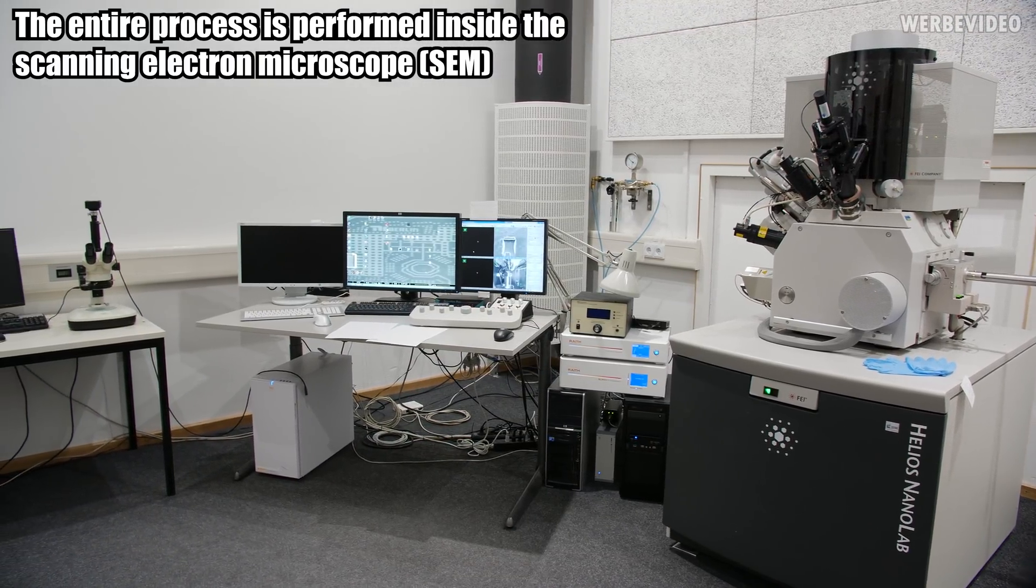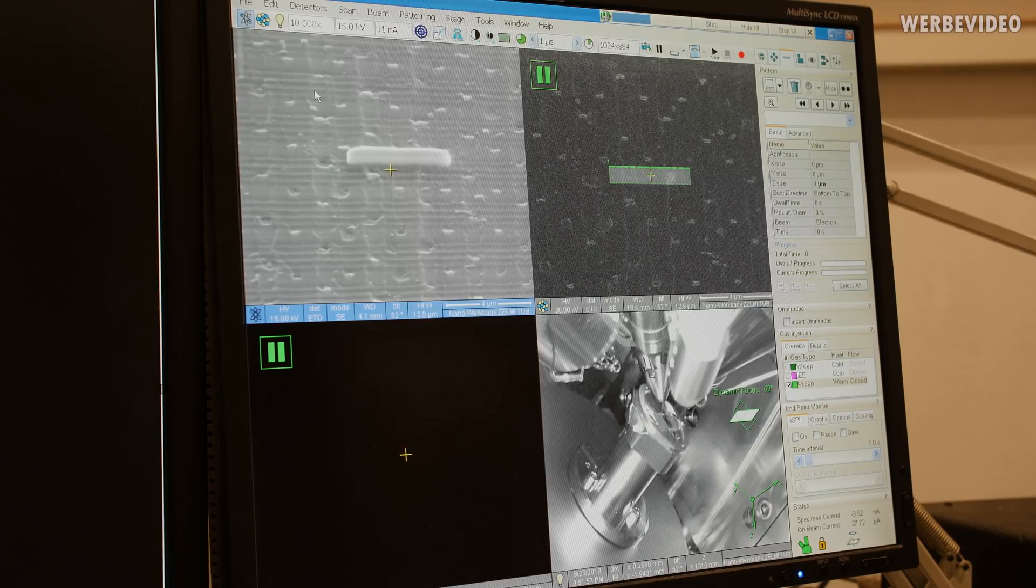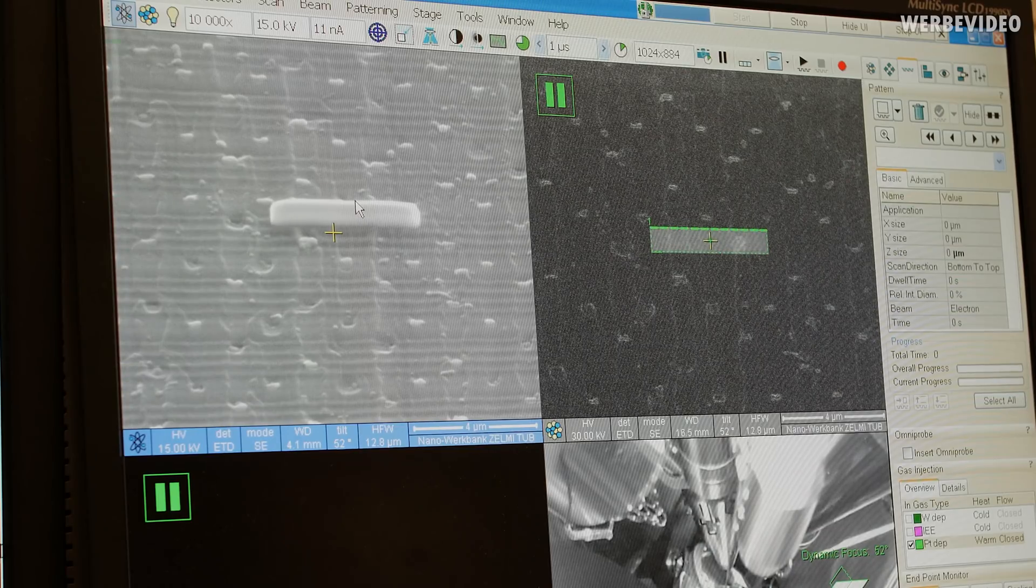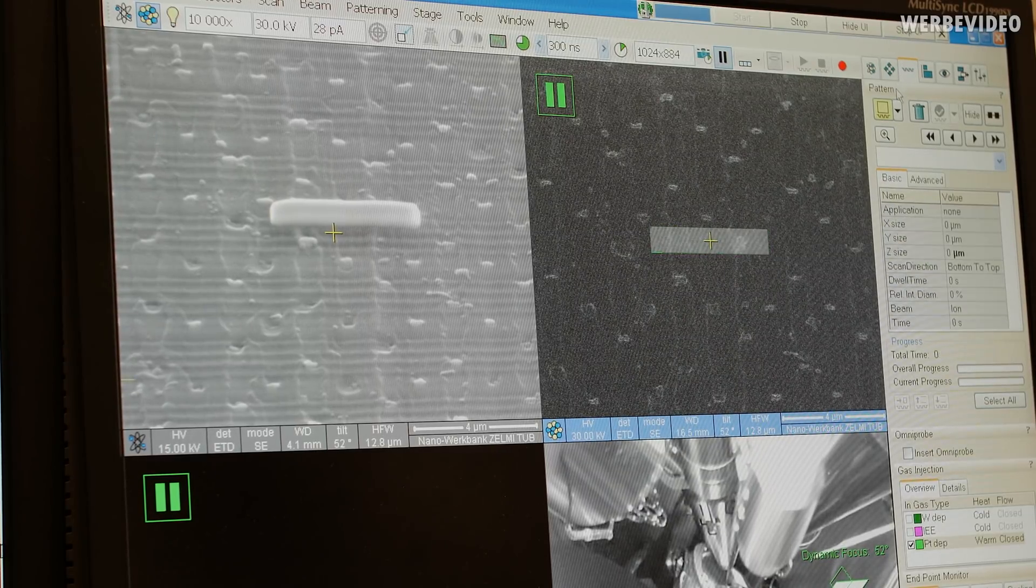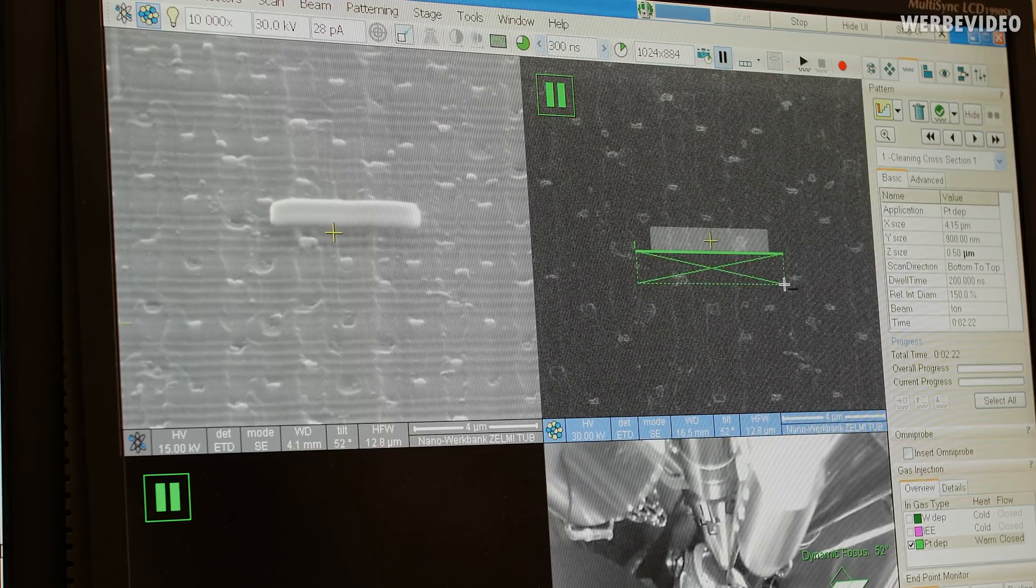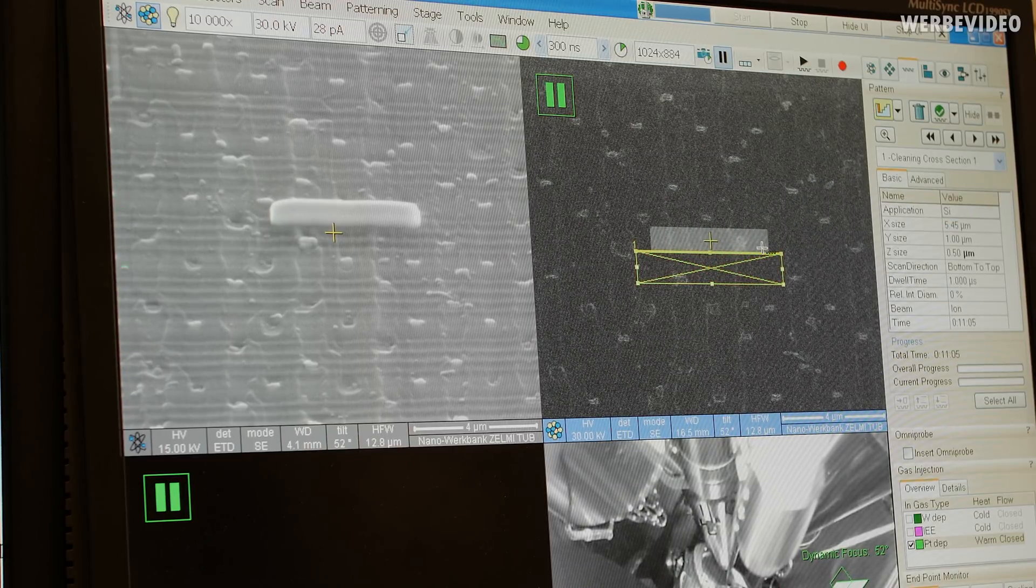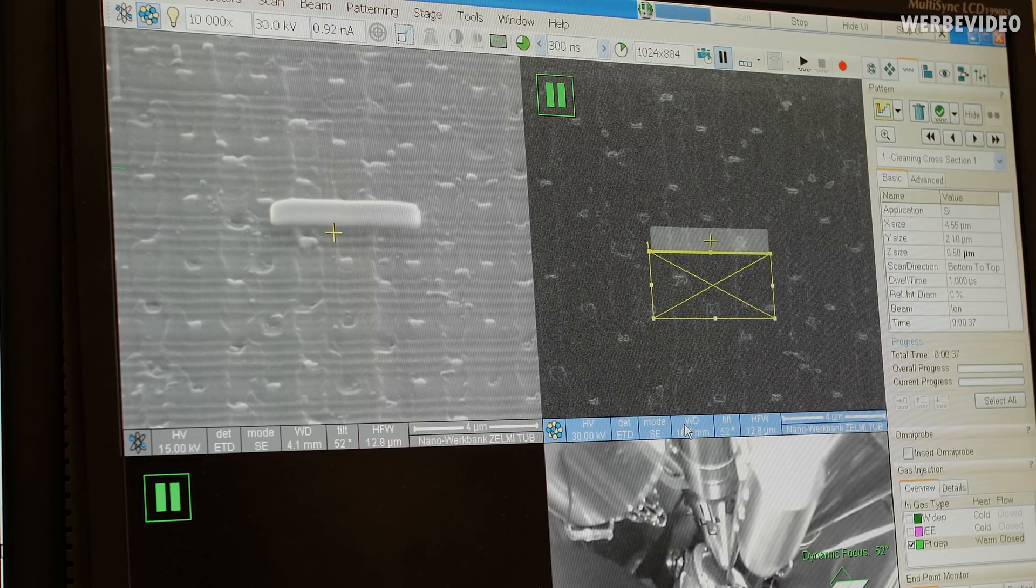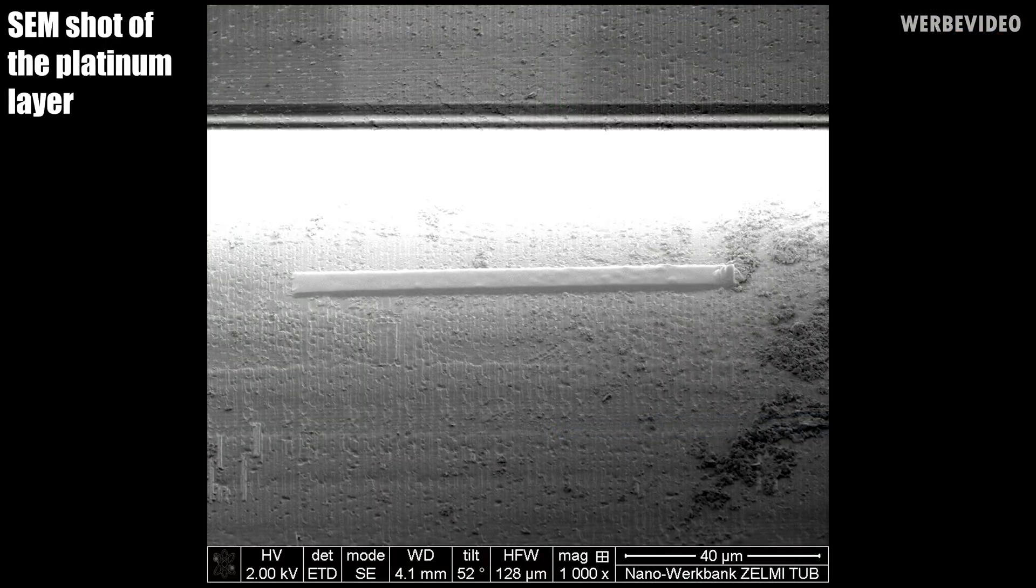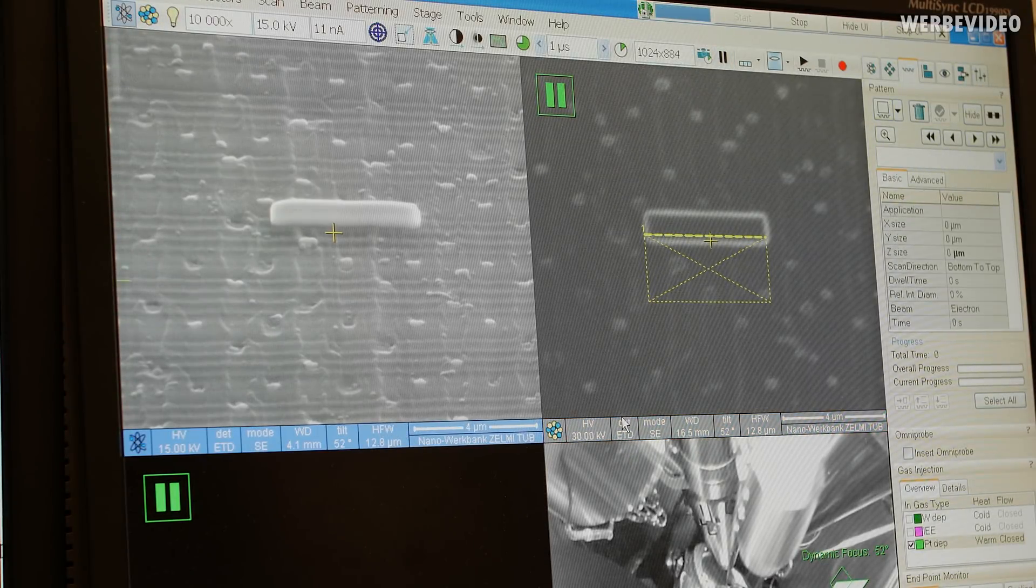And in the next step, we will use the ion beam to remove material here just in front of this protection layer. Now this process is finished. You can clearly see here this protection layer made of platinum. And in the next step, we're going to use the ion beam to remove material. And I will use another patterning here. I now change the application file from platinum deposition to removal of material. And this will be my area. I increase the ion beam current a little bit to make it faster.